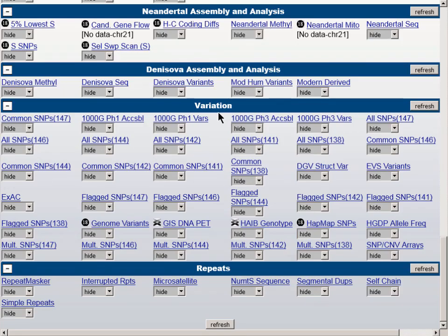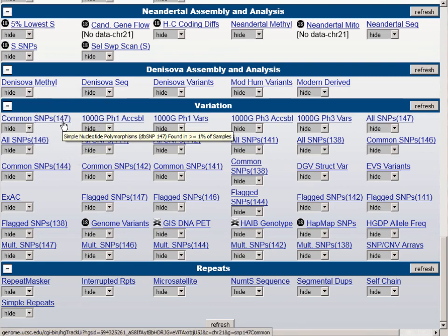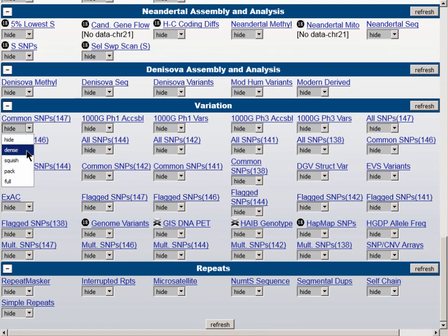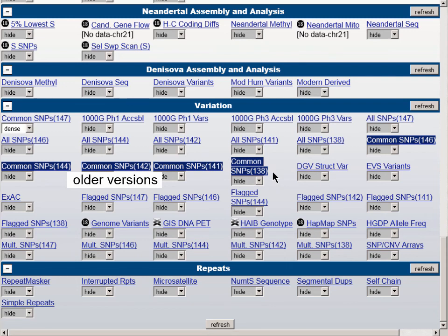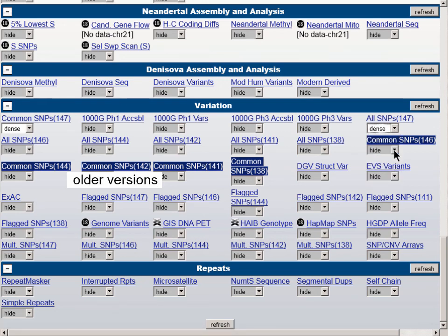At this time, you will see that on HG19 we have a track called Common SNPs version 147 as the first track in the variation group. Let's turn it on to Dense. There are other common SNPs tracks: 146, 144, 142, 141, and 138. The common SNPs tracks are all tracks that have been filtered from the corresponding All-SNPs track, using the accepted definition of 1% minor allele frequency. In addition, we do still have the All-SNPs tracks, which are the complete set of SNPs, analogous to the SNP 130 track we saw on HG18.